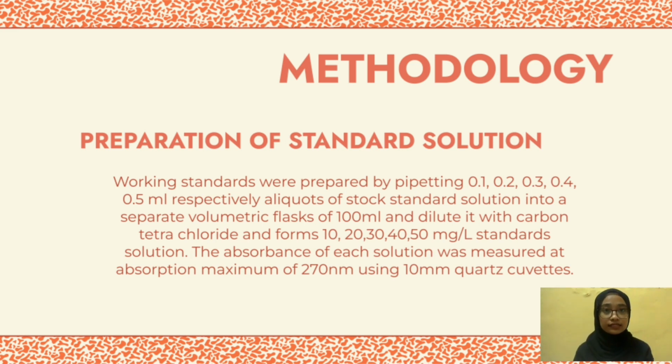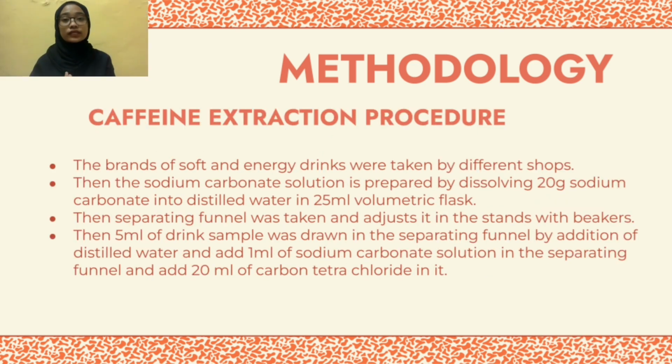Aliquots of stock standard solution were put into a separate volumetric flask of 100 ml and diluted with carbon tetrachloride to form 10, 20, 30, 40 and 50 mg per liter standard solutions. The absorbance of each solution was measured at the absorption maximum of 270 nanometer using a 10 mm quartz cuvette. The last one is the caffeine extraction procedure.